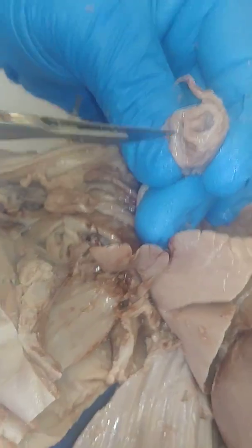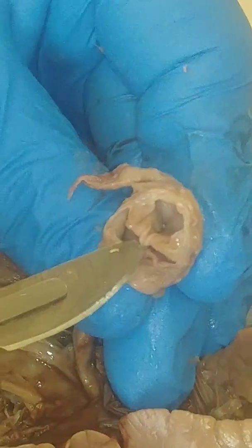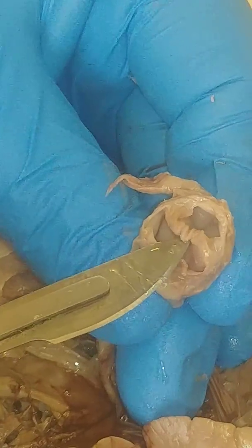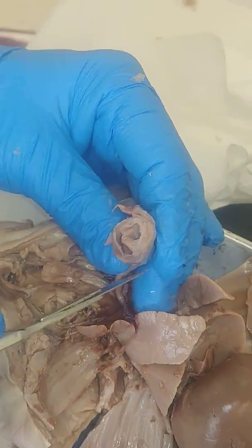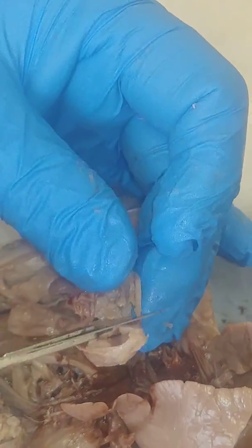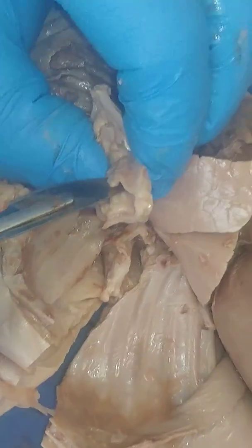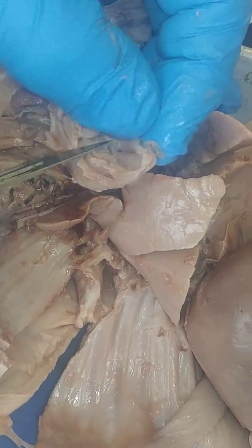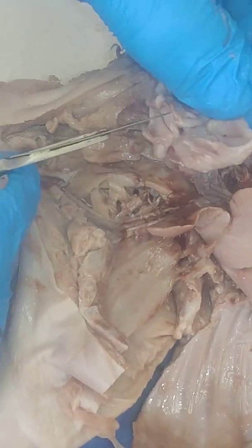Okay, we're looking through here. This is the voice box area. This opening is the glottis. This little flap right here that goes across there to close it, that's the epiglottis. Okay, and if we can cut down through here, and I don't know if this is going to show up very clear for the vocal cords. No, we can't see them very well. They're not very well developed on this.